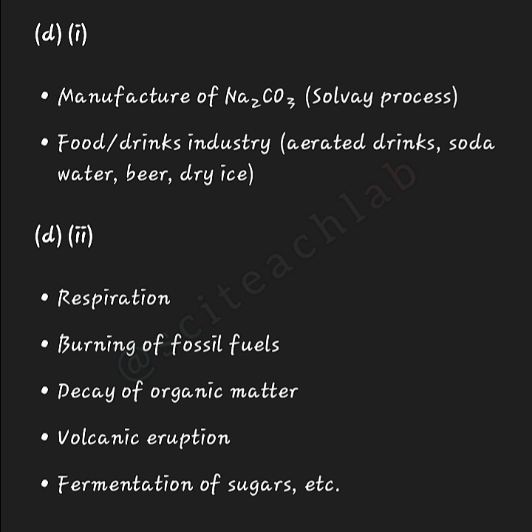So you see how easy it can be for you to pass question 1 chemistry in WAEC or NECO. So with that, you see 10 marks plus 5 marks, that's 15, plus 4, 19, plus 3 marks, 22 marks gotten with smiles. Easy peasy.